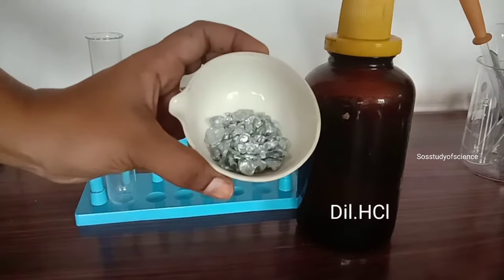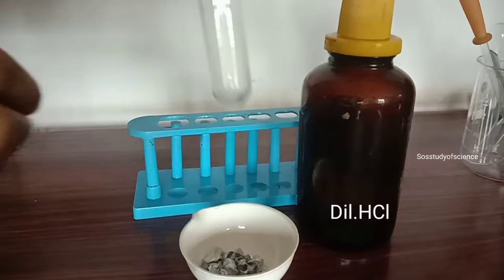Zinc metal is silver in color and it is light weighted. Now you need to take some zinc granules, take the test tube and drop the zinc granules inside a test tube.